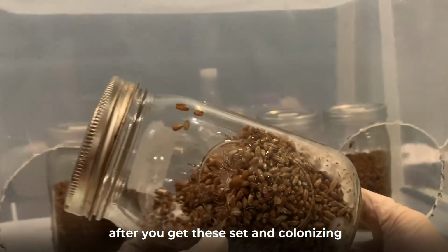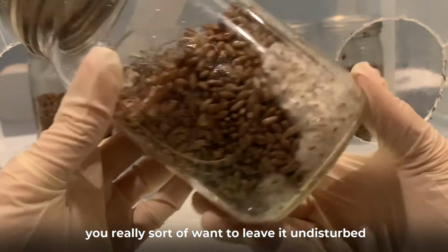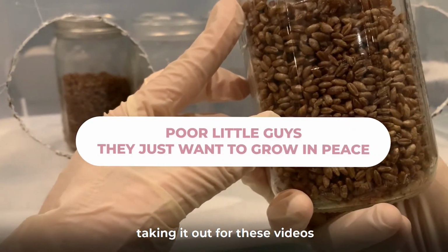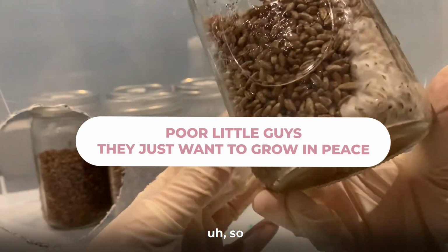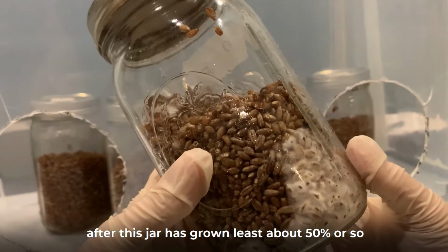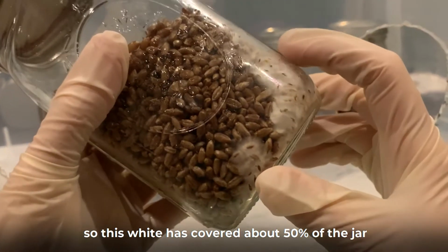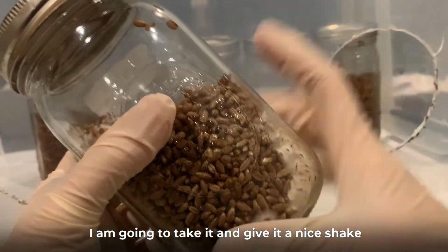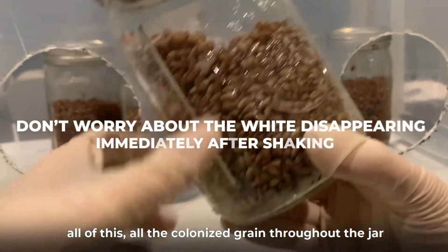After you get these set and colonizing, you really want to leave them undisturbed. We haven't been treating this one all that nicely, taking it out for these videos, but it's worth it. After this jar has grown at least about 50% or so, when this white has covered about 50% of the jar, I'm going to take it and give it a nice shake to evenly distribute all the colonized grain throughout the jar.